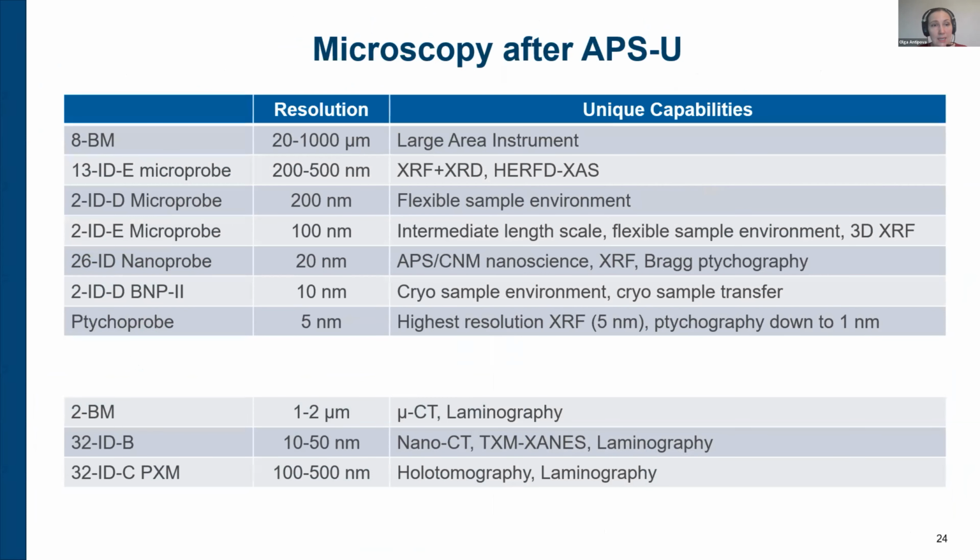So this is a nice summary of all the beamlines which will be available after the upgrade, from lowest resolution to high resolution, as well as our full field imaging beamlines. As you can see, we have quite a nice collection which may fit your research and even bring new science after the beam is back.